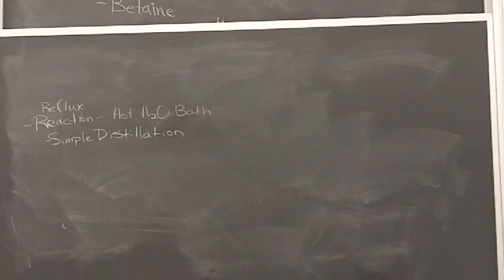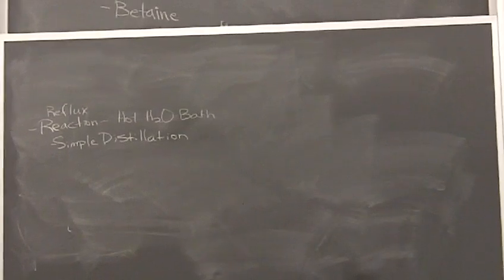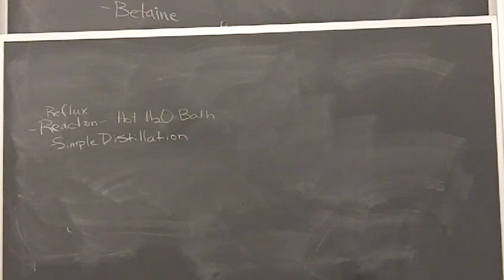You're going to add hexane to that mixture that has your product in it, and you may start already seeing solid in it, that's fine. Then we're going to use what we call a rotary evaporator, which this is a best looking picture, but you guys will see this in lab this week. This is a really nice tool because it's a way to do a simple distillation under vacuum so it goes faster.